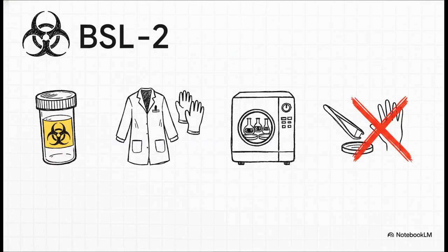And finally, look, we cannot overstate the importance of safety. Fecal culture is unique because your whole goal is to concentrate live, host-seeking, infective organisms. This is a living risk. All this work absolutely must be done under biosafety level 2 conditions. That means every sample is treated as infectious. It means proper PPE, gloves, lab coat, and crucially, it means using forceps, never your bare hands, to handle things like filter paper. When you're done, everything has to be decontaminated, ideally by autoclaving to completely neutralize that threat.